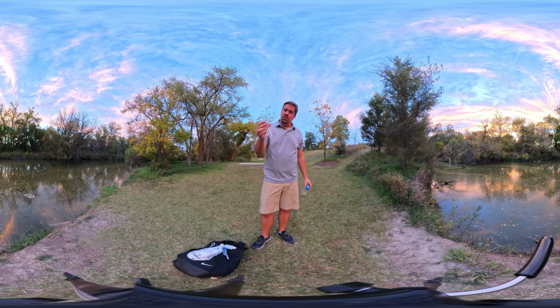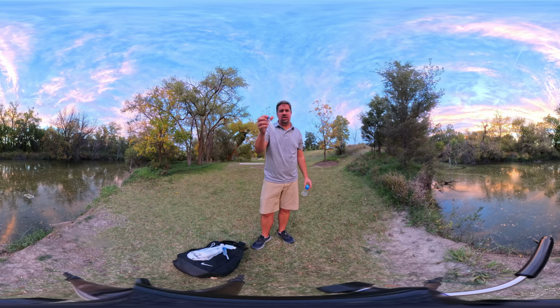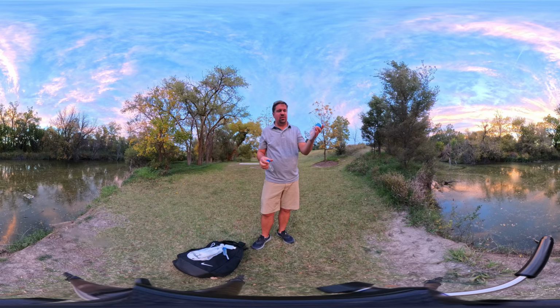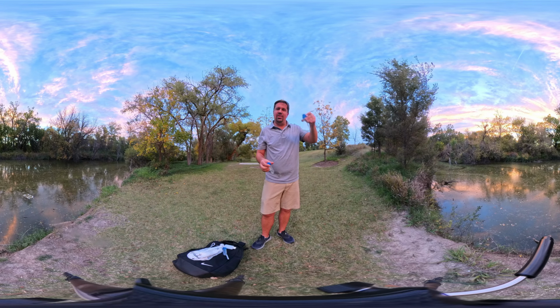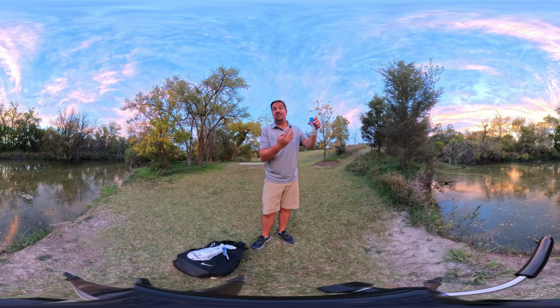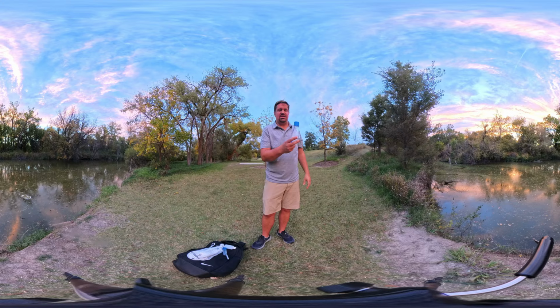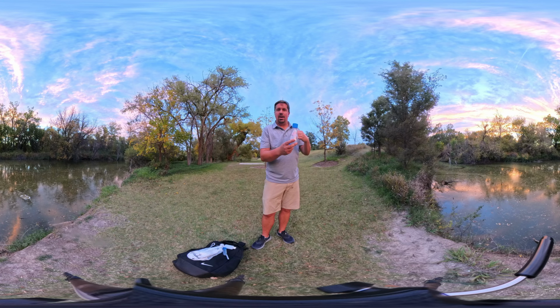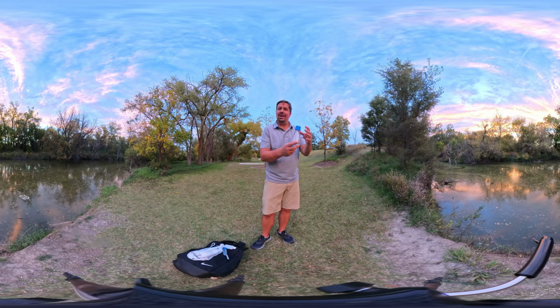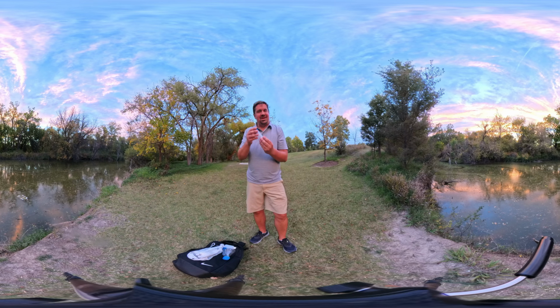So we're going to fill these presumed cyanobacteria, whatever these organisms are, first in here, and then in the lab I'm going to transfer them to these culture flasks. They will then be agitated around the clock with simulated sunshine from a growth light for about 15 hours a day, thereby cultivating and ideally accumulating them in these flasks. But we're not there yet. We first have to collect them.